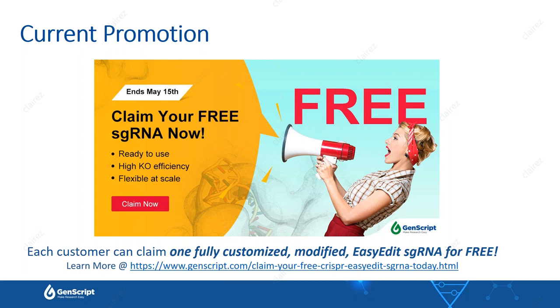Yeah. So actually, I think our proteins and our guide RNA sequences, if we do the design for you, are more optimized for mammalian cells. But we do have a CRISPR-based bacteria editing platform ourselves, so we can do that for you. I think we mostly use a plasmid-based method. For the exact details, I'm not 100% sure at this point, but I believe it's possible to do. It's just that our RNP system is not optimized for bacteria.